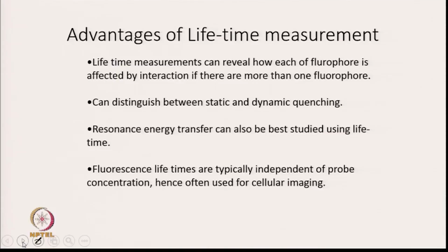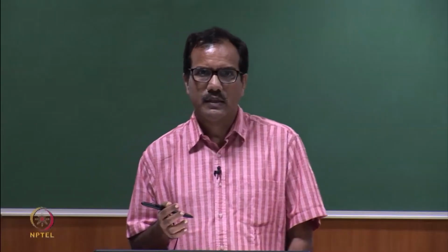So, advantage of lifetime measurement is lifetime measurement can tell you how each of the fluorophore is affected by interaction if there are more than one fluorophore, which is not possible when we are trying to study the fluorescence by steady state fluorescence measurement.